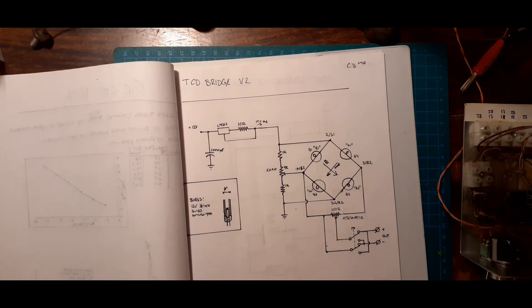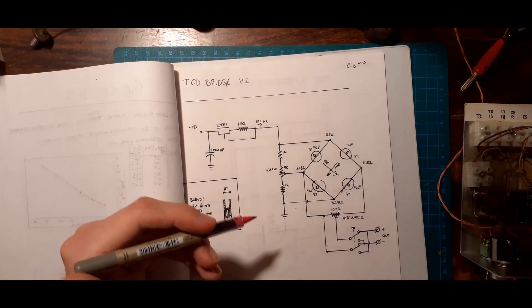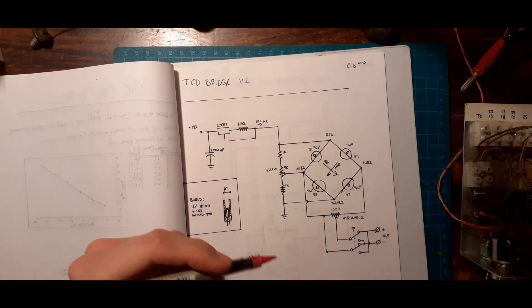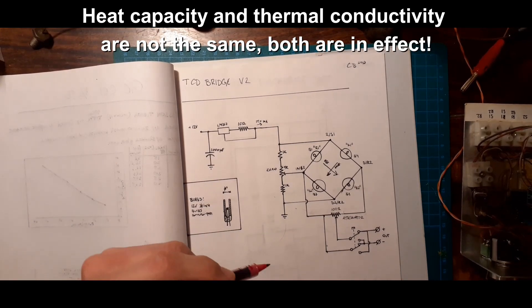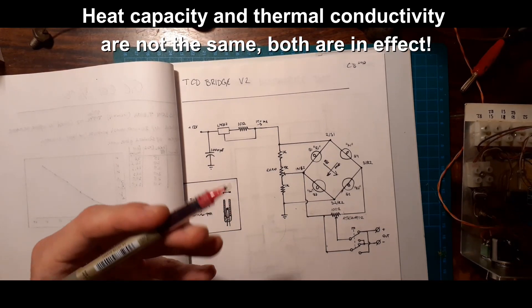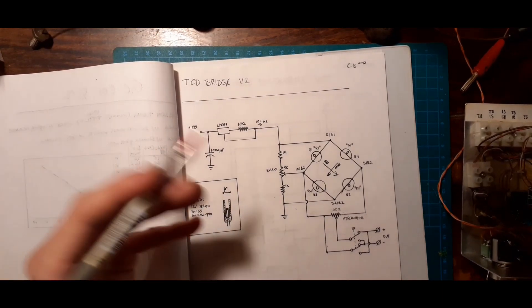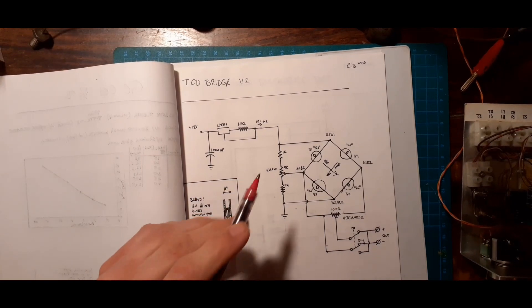The theory of this thing is pretty simple, actually. For any resistive element, when a current is passed through it, it'll heat up until it reaches some kind of equilibrium with the heat being wicked off of it. And in a steady flow of gas, the amount of heat being wicked off of it is proportional to the thermal conductivity of the gas. So that means this is an intrinsic property for each gas, so it'll differ between different gases. That's what you exploit in this kind of detector.